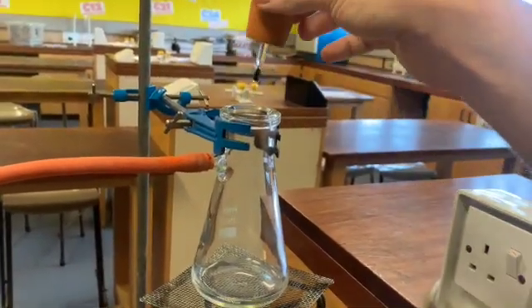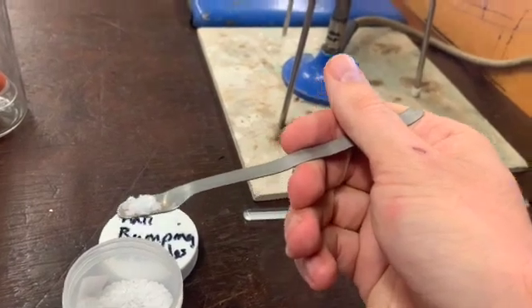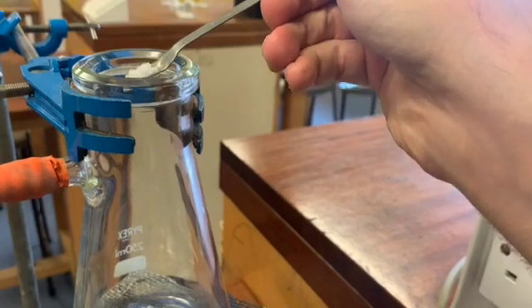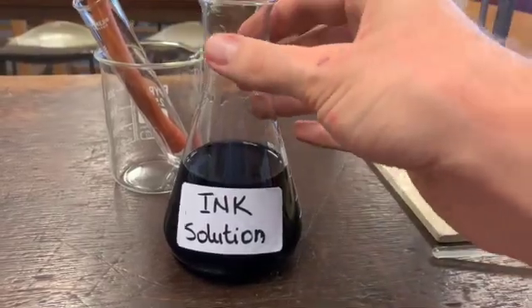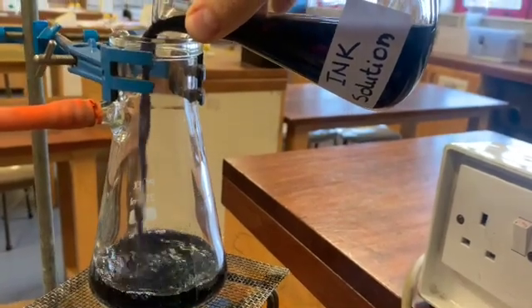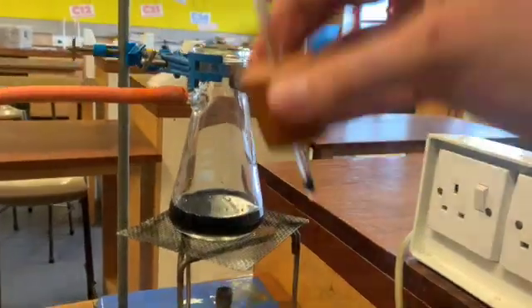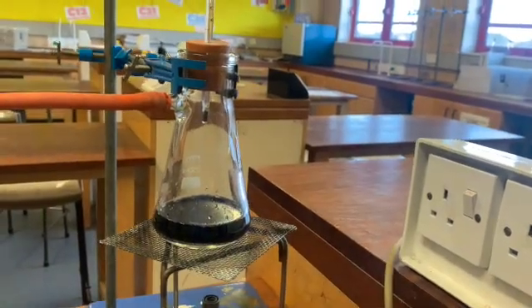So what I'm going to do is remove the bung from the top. I'm then going to get my anti-bumping granules. You don't need very many - only a few is really needed. We're just going to place these into the neck of my flask like this. You can see them at the bottom of the flask now. We're now ready to decant the ink solution into the top. I'm just going to take the ink solution and put it into the flask. You don't want too much, maybe enough to cover the bottom of the flask. Then just reapply the bung on top, and we're ready to start our distillation.